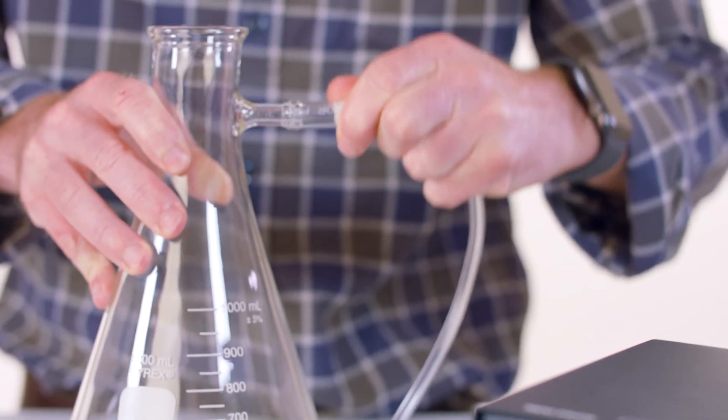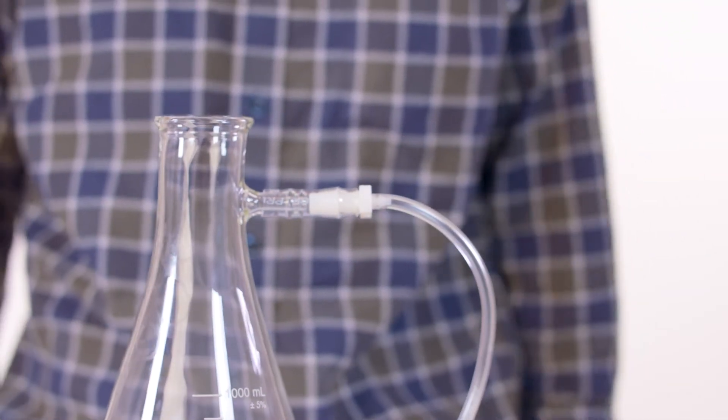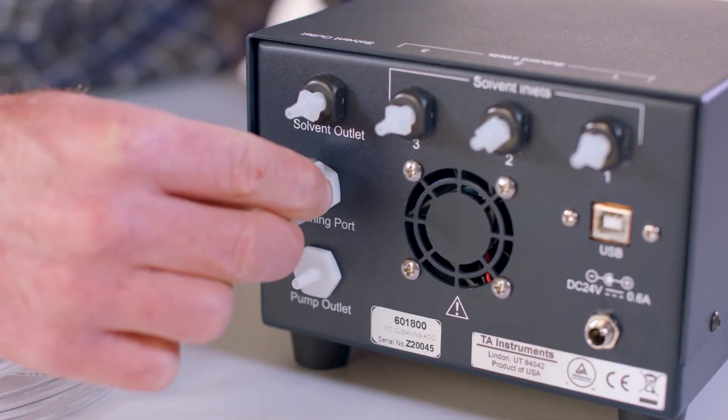Next, we want to attach a vacuum tubing to the sidearm of the Erlenmeyer flask and cleaning port, which is labeled on the back of the instrument.